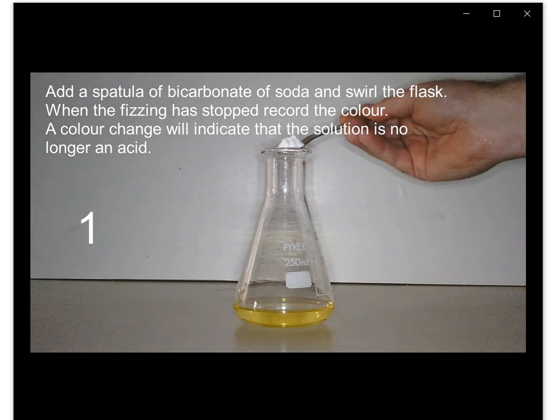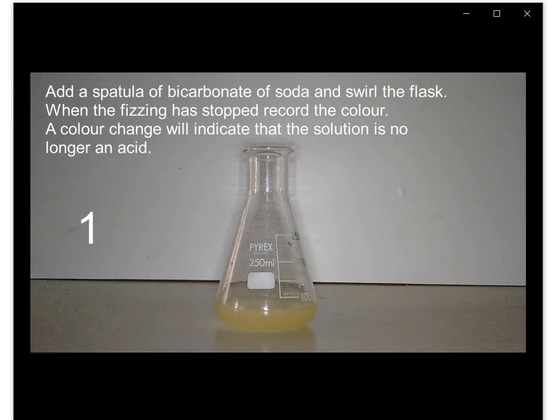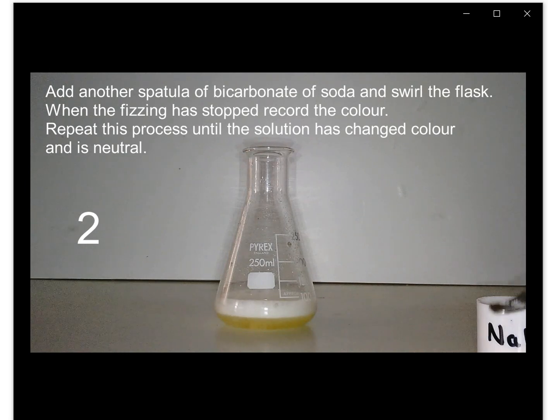I'm going to add a spatula of bicarbonate soda, and it's going to mix. Tight sounds for like effervescence. That's fizzing. We're going to swirl it, and then once the fizzing has stopped, I'm going to check the colour. We're going to keep doing this until we get a colour change. So 1 and 2, this is number 2, this goes in your table.